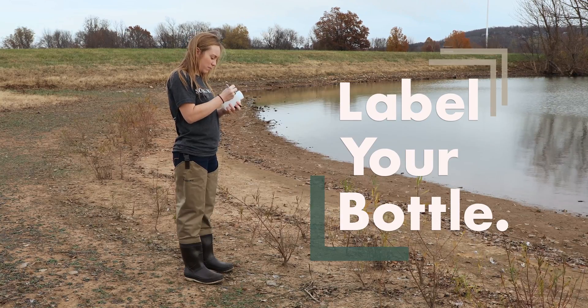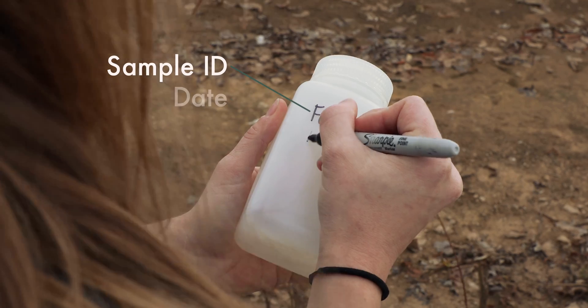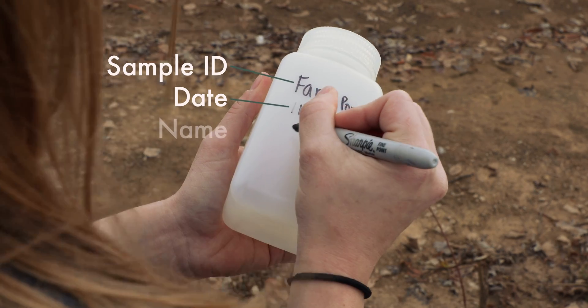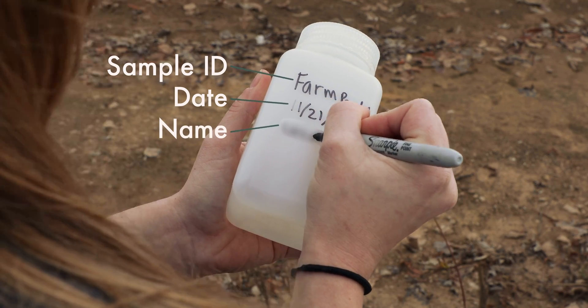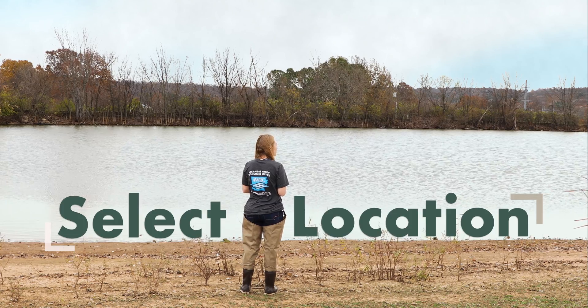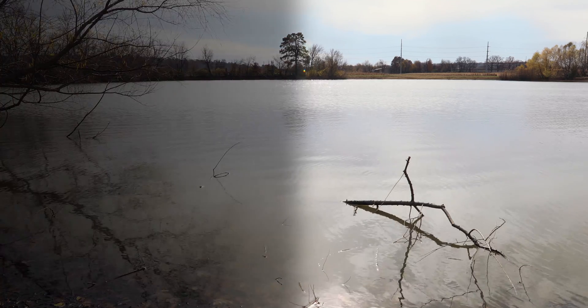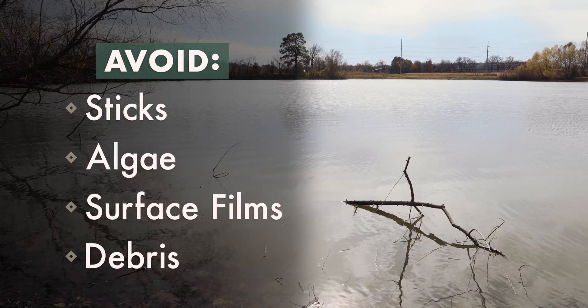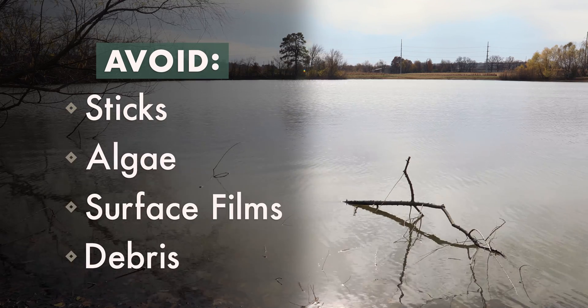First, label your bottle with a unique sample name specific to your property — for example, Farm Pond 1 — the date the sample is collected, and your name. Next, select an appropriate sampling location. Choose an area that is well away from the perimeter of the pond and avoid sticks, algae, surface films, and other debris that can contaminate your water sample.